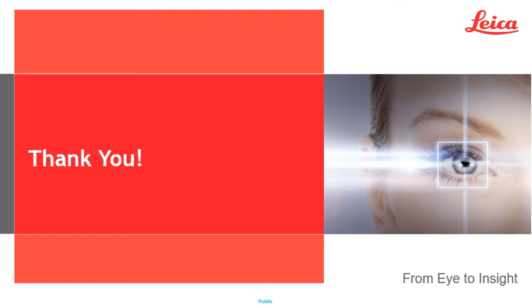So the answer here is it looks at all of that. The features are created through a set of processing algorithms that look at pixel information, how 2 pixels relate to each other, how 3 pixels relate to each other, and it builds and builds that layer.